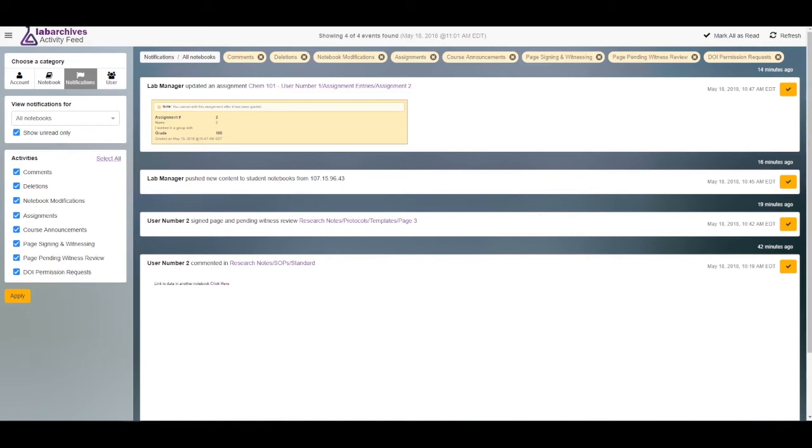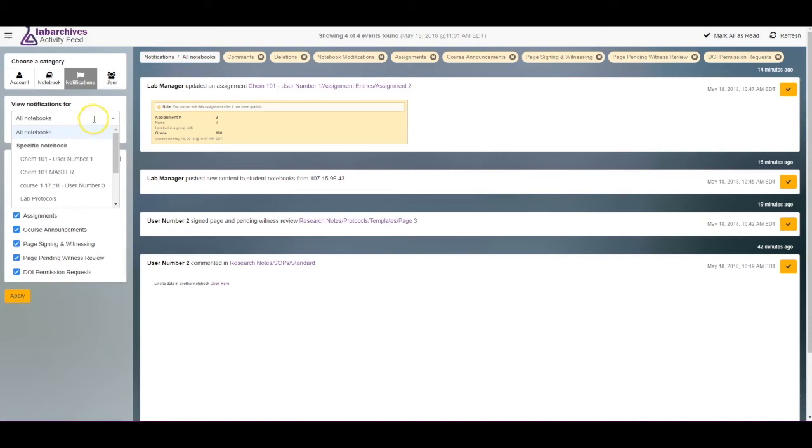Notifications are a great way to keep track of comments, assignments, or page signing and witnessing. You can view notifications for all notebooks in your account, or select a specific notebook in this drop-down menu.